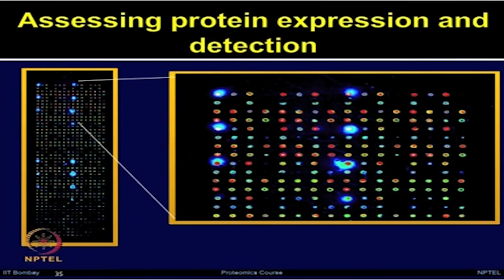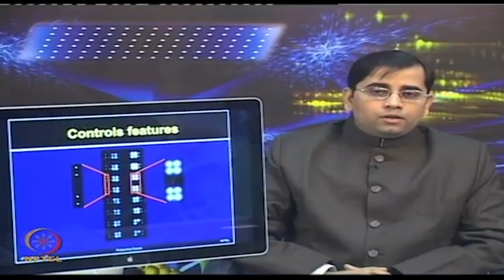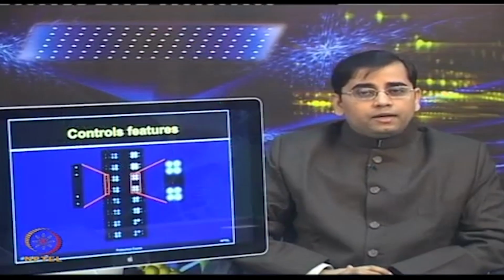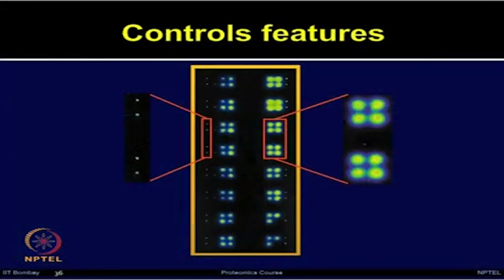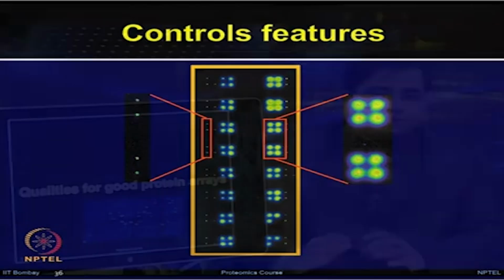It can also be used for statistical analysis later on by the biostatistician, so that different protein expression can be normalized. Another control feature and QC check, shown on the slide, is the same gene printed 4 times in repeated blocks, and then negative controls are used to give an idea of the background.